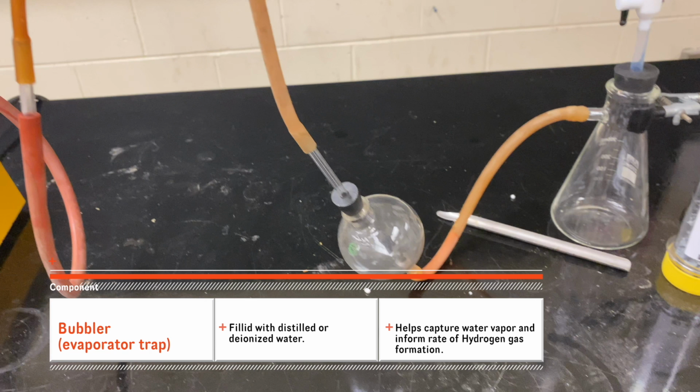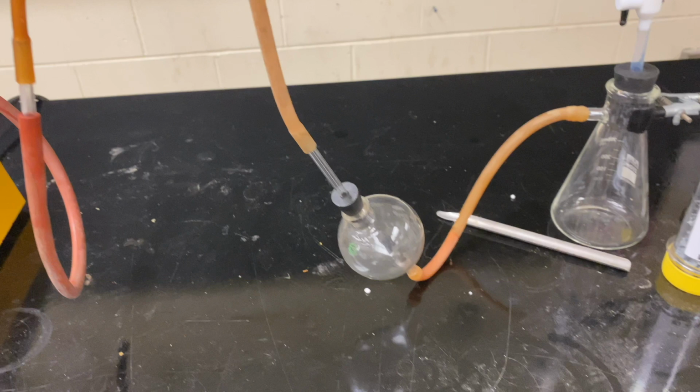This component is called the bubbler. The piece of glassware is called an evaporator trap. It's filled with distilled or deionized water. It also helps capture water vapor from the reaction that produces the hydrogen gas, and it also helps us monitor the amount of hydrogen gas being produced by watching the bubbles that are formed.